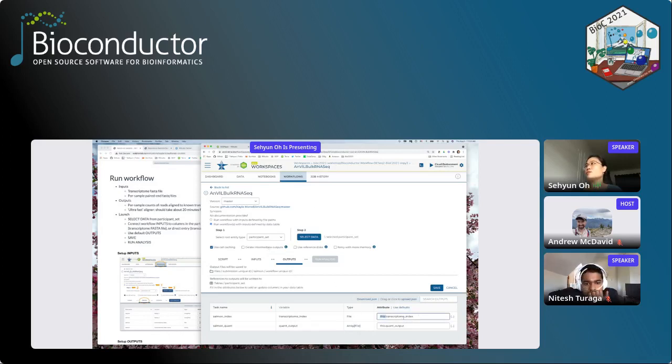So whatever your output will be is linked and moved together with your input. So you don't need to try to name it in a clever way to remember which one is which, how it's connected, where it comes from. All output will link back to the input file, and then save this, and that's it.